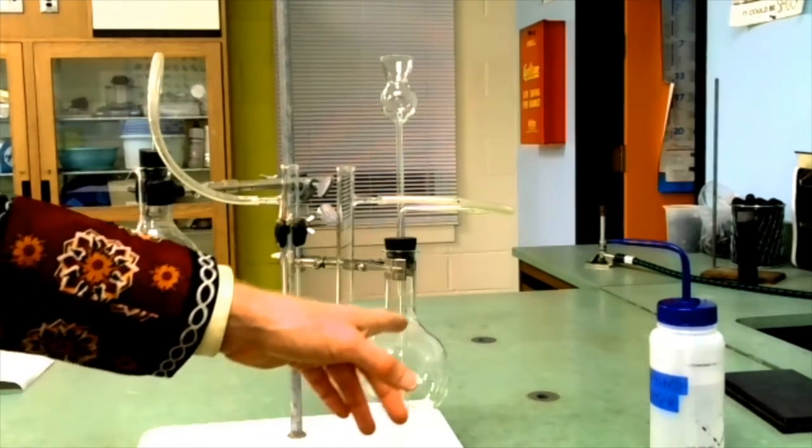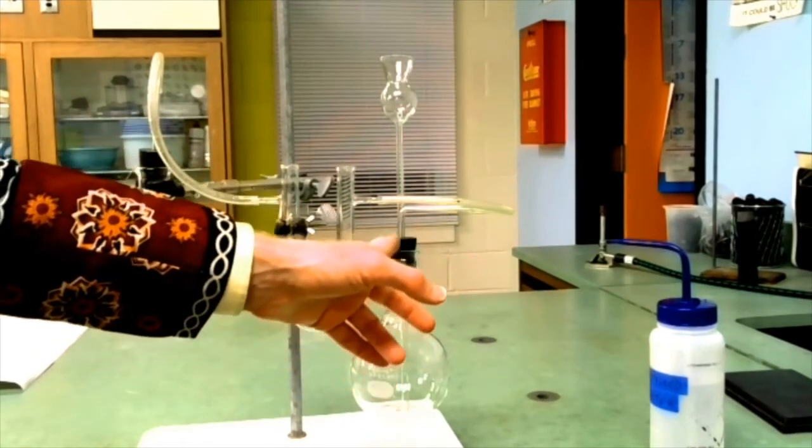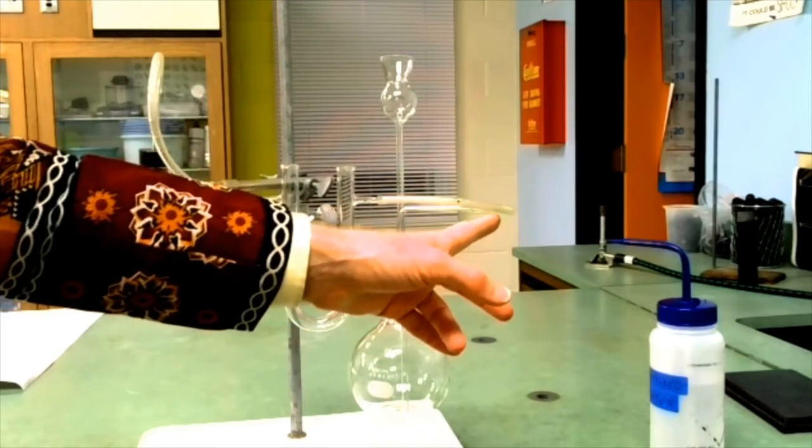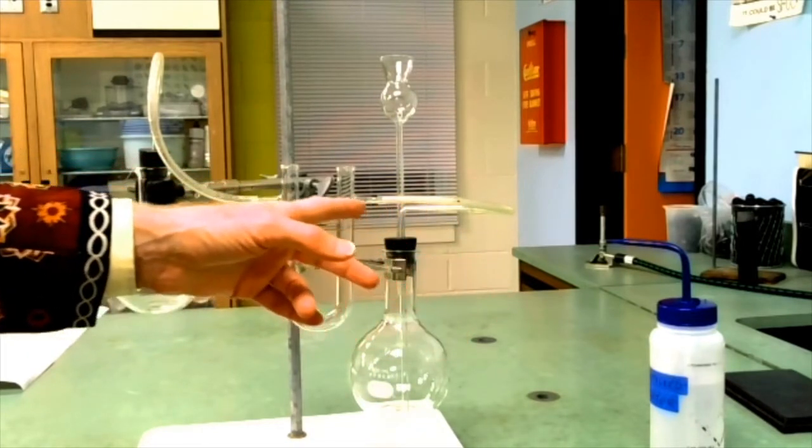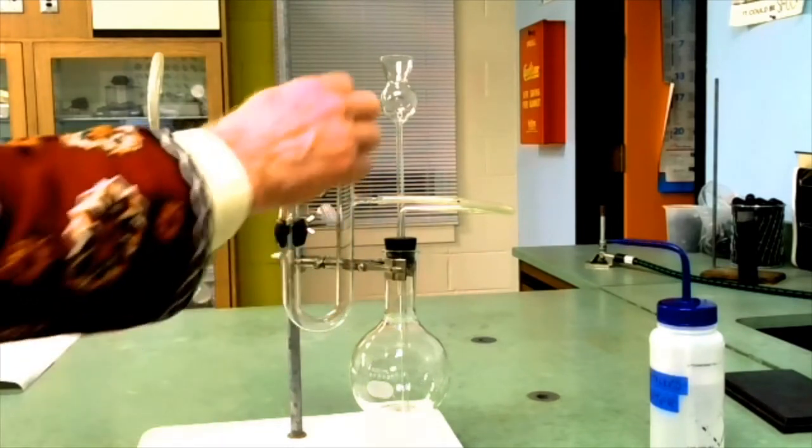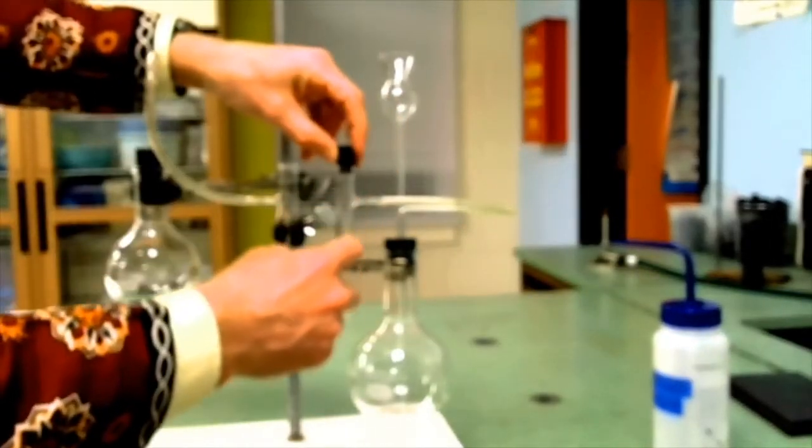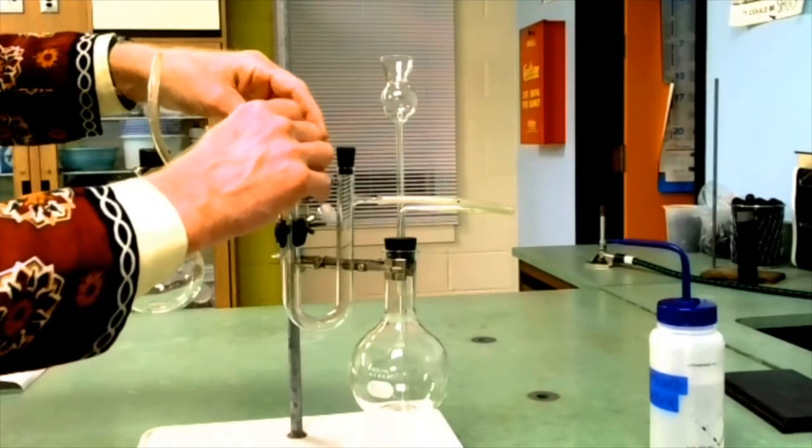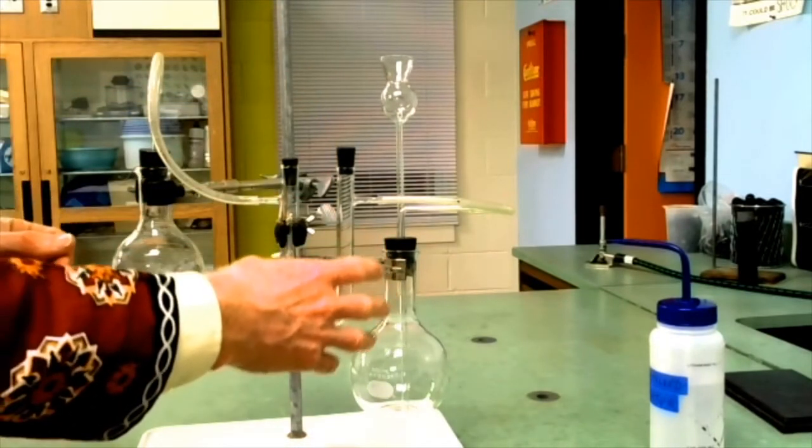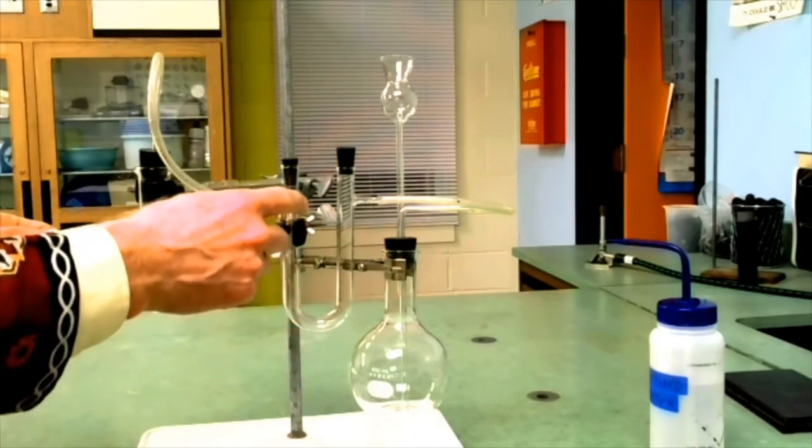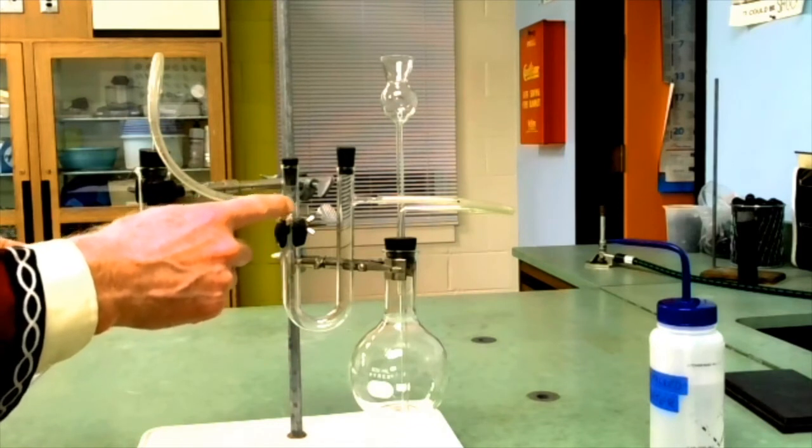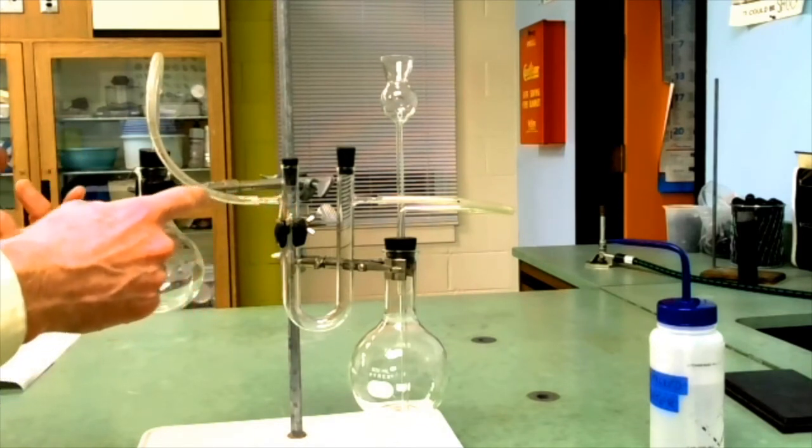The carbon dioxide that's produced will come out this tube and then go into the drying tube. It will go through the calcium chloride, which will take the water vapor out. The water vapor will stick to the calcium chloride so that the carbon dioxide that comes out the drying tube is not going to have water vapor in it.